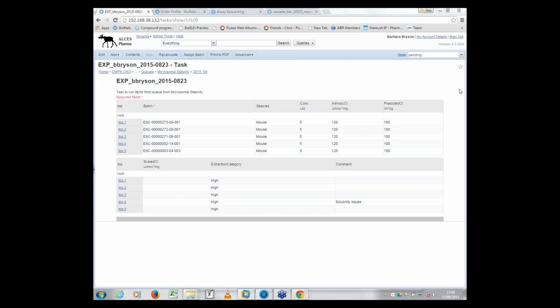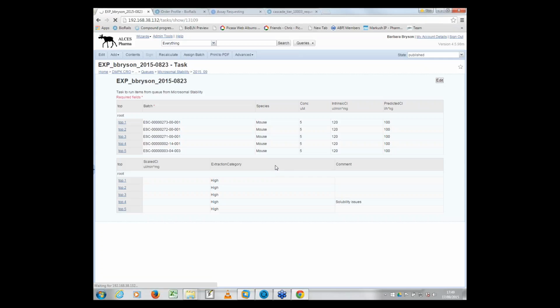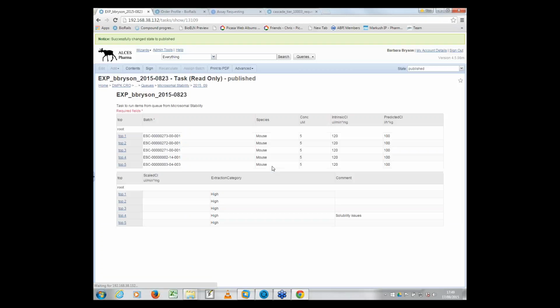And then all we're going to do is change the status of this experiment to say it's published, which means the results are available. If I then went back to Walter's original request, he'll see that these particular samples in this particular assay are now published and the results are available. Also, we're recording the timings at which you do all those things so we can generate key performance indicators and provide reports to management as well.